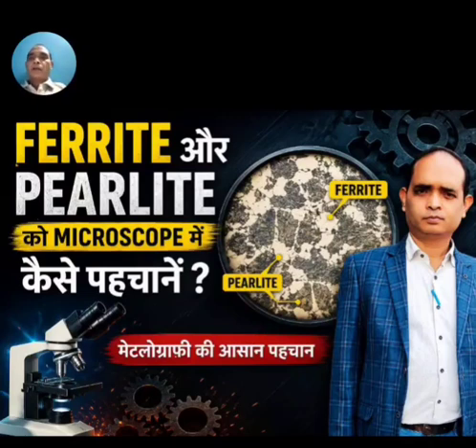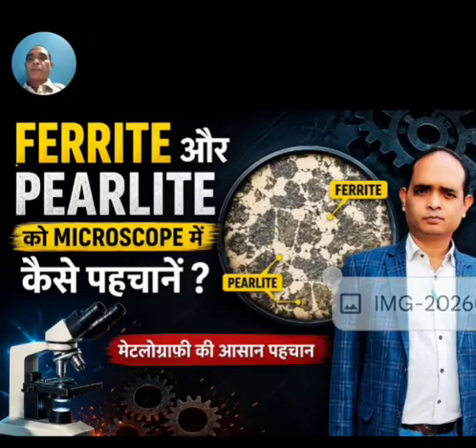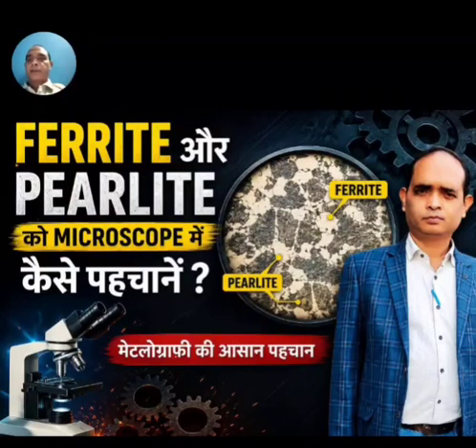Under an optical microscope, pearlite appears darker than ferrite. At low magnification, pearlite looks like dark colonies. At higher magnification, the fine lamellar structure becomes visible. Properties of pearlite include higher strength than ferrite, higher hardness, better wear resistance, and lower ductility than ferrite.